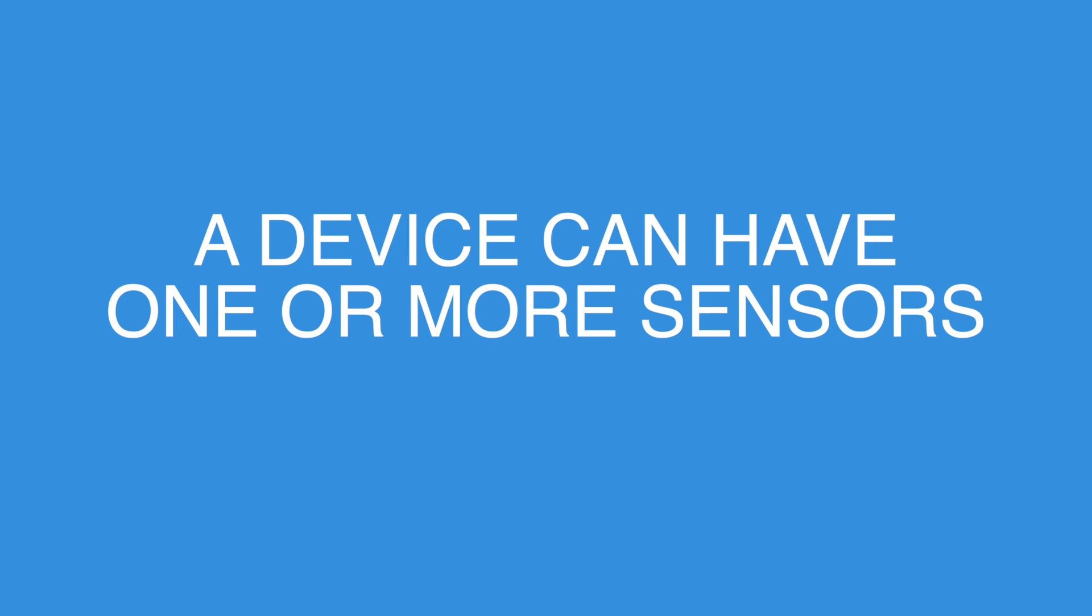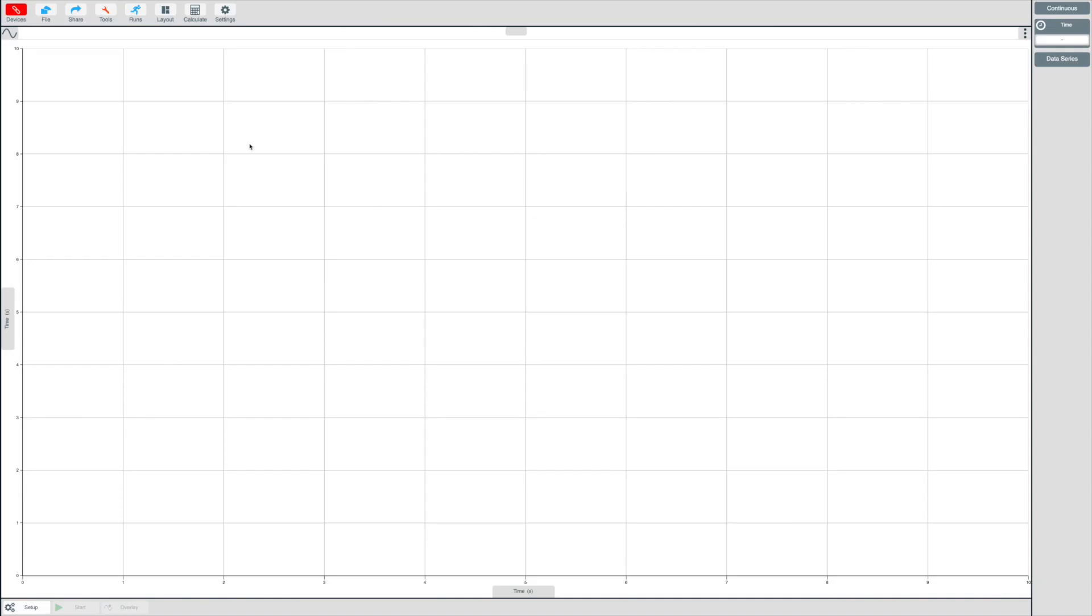Some devices will have one sensor and some devices may have multiple sensors. When you first launch the EasySense 2 software, you will notice a devices button on the top left-hand corner of the EasySense 2 software.